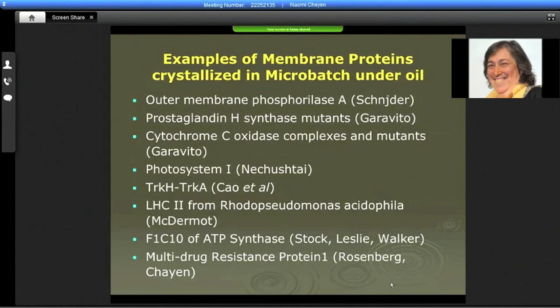And this could be, we were thinking, it was with Ben Henkamer that we did the very first membrane protein under oil, back in '92, and came up with a theory that the oil is needed to mop up the excess detergent. Of course, for membrane protein, you need to solubilize them.